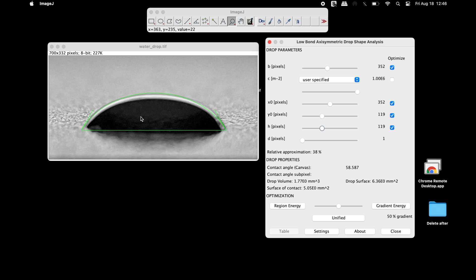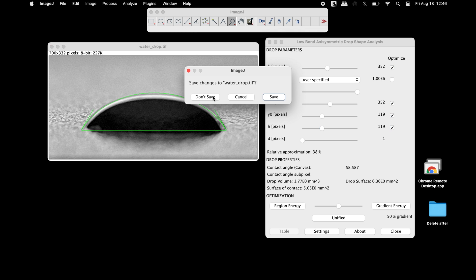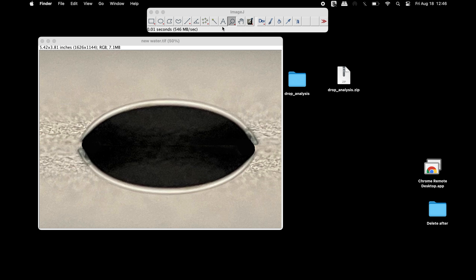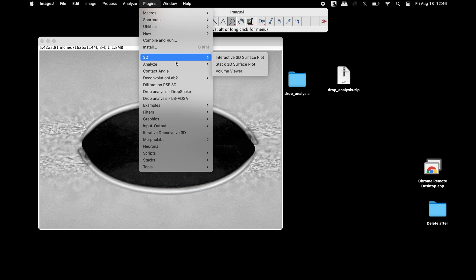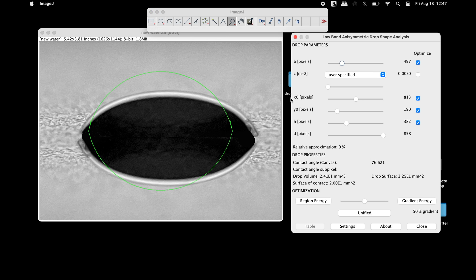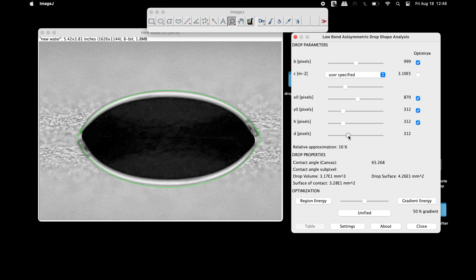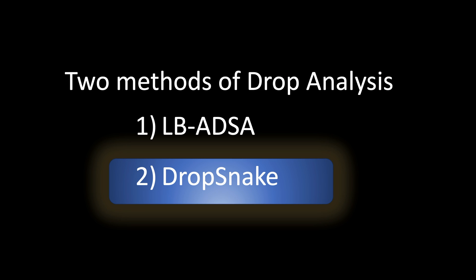This image can be saved if required. Similarly, water droplets having a reflection, or objects that are round in shape, can also be analyzed. Open the image using ImageJ, convert it into an 8-bit image, open the plugins, and adjust the drop parameters accordingly so that the fitting is aligned to the water droplet. Once all adjustments are performed, the contact angle can be visualized.